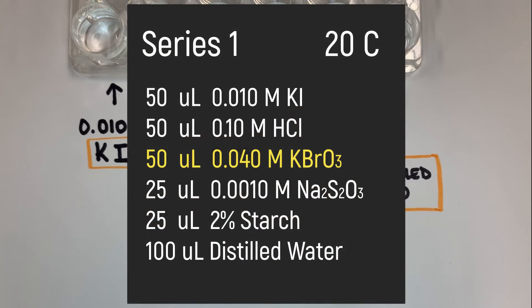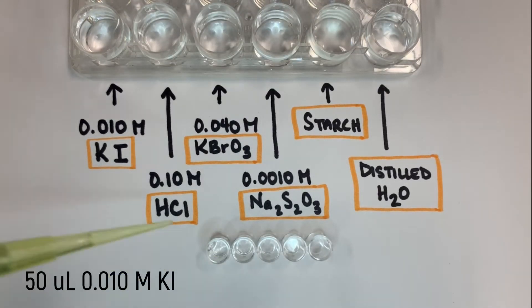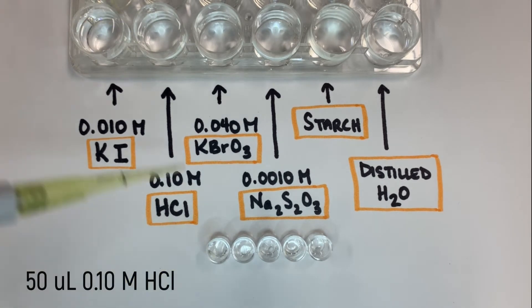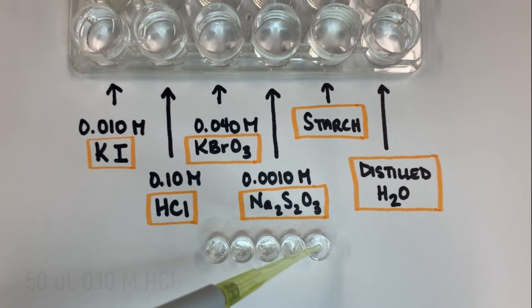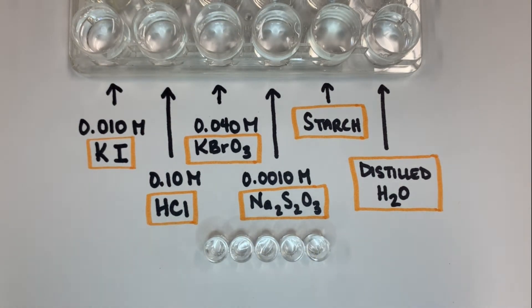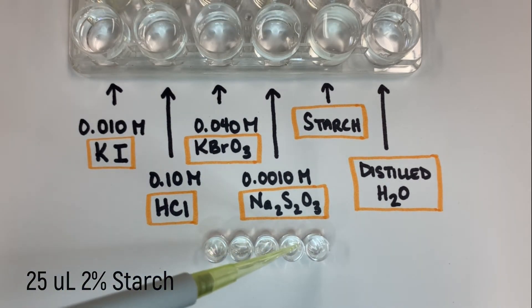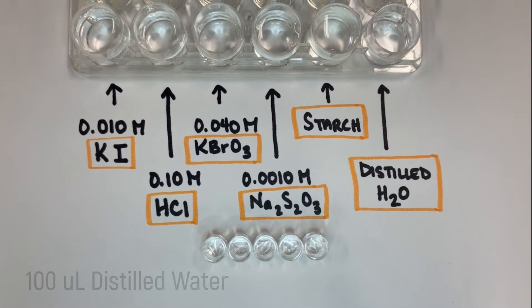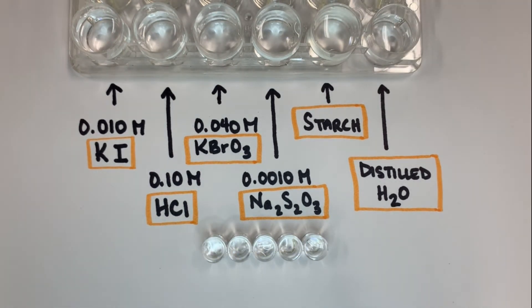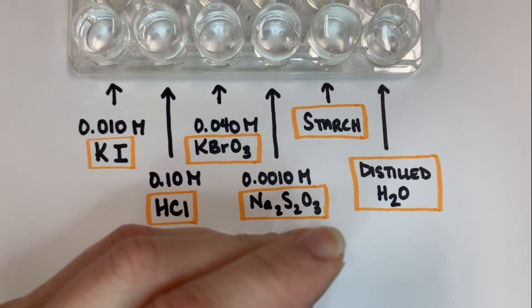Here's our ingredient list for series one, which takes place at 20 degrees Celsius. You can see the potassium bromate is highlighted, which indicates that we will add that last. So let's begin. I'm going to use a micropipetter to add 50 microliters of 0.010 molar potassium iodide. Then with a clean tip, I'm going to add 50 microliters of a 0.10 molar hydrochloric acid solution to each of my five trials. Now I'm going to add 25 microliters of the 0.0010 molar sodium thiosulfate solution, 25 microliters of starch, and 100 microliters of distilled water. This just ensures that we end up with 300 microliters of total solution. The next step is to stir each micro well gently to combine all of the ingredients. And the last step is to add the potassium bromate.